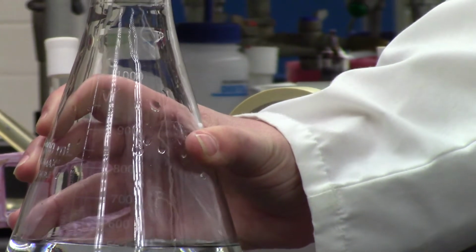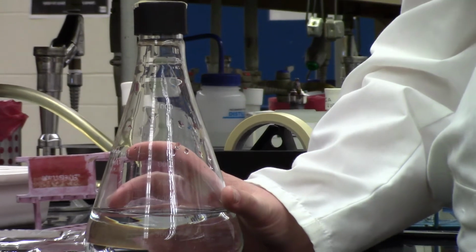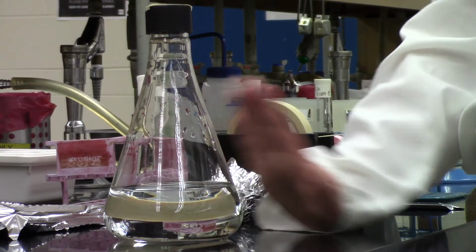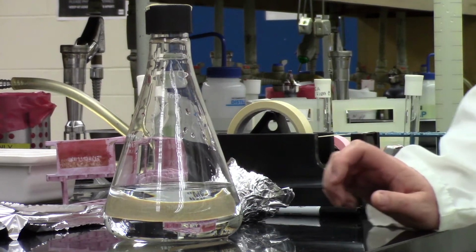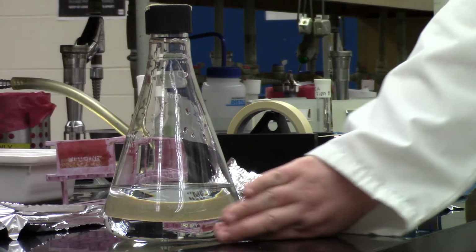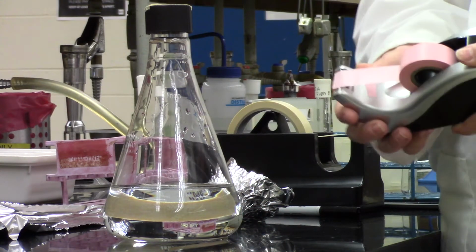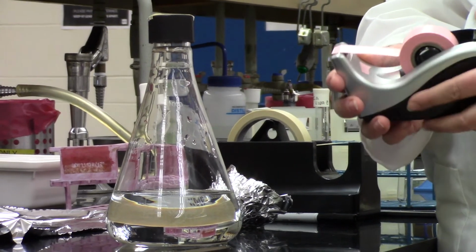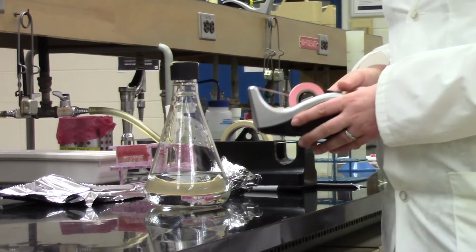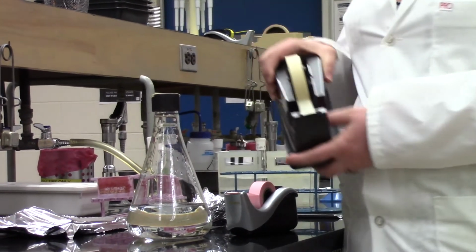The other thing you want to include, so if you were only autoclaving one thing, it might be okay to put it in without a label, but you're almost never going to use the autoclave with just one item in it. So you want to make sure that your item is labeled with your name, the date, and the contents of your container. And to do that, you want to make sure that you're using the colored laboratory tape. So we've got all different colors around, all of them are fine. The only tape that you want to avoid using is the masking tape.